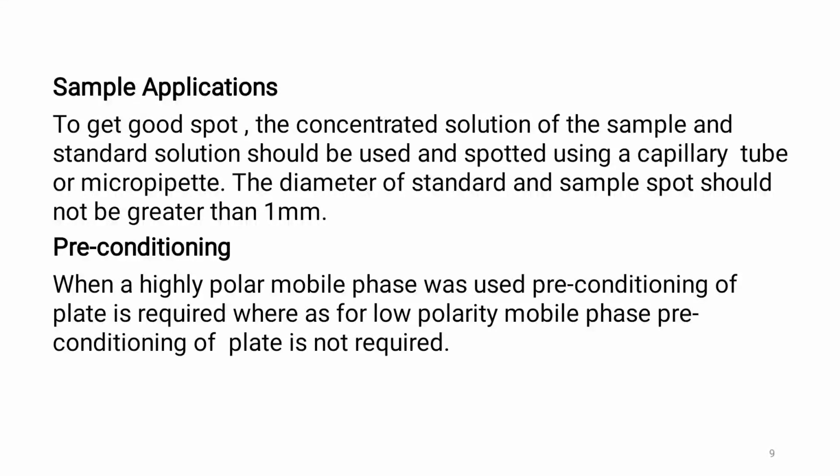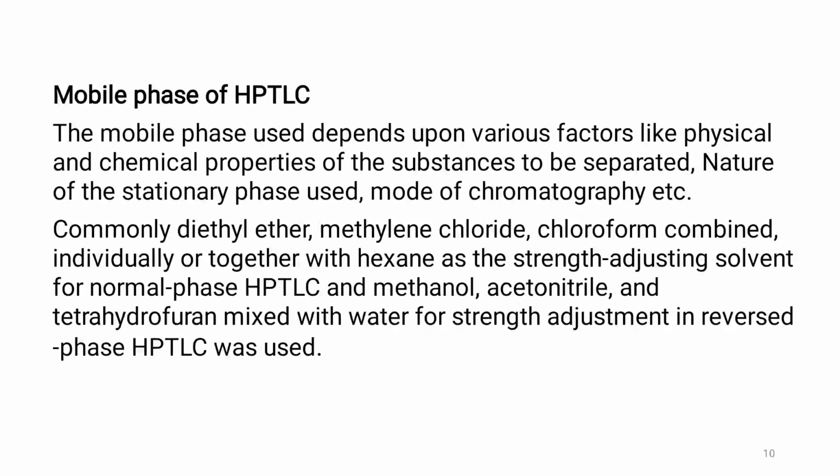Now, the main part of HPTLC, which plays an important role in separation of components from mixtures, is the mobile phase. The mobile phase used depends on various factors like physical and chemical properties of the substances to be separated, nature of the stationary phase used and mode of chromatography, etc.